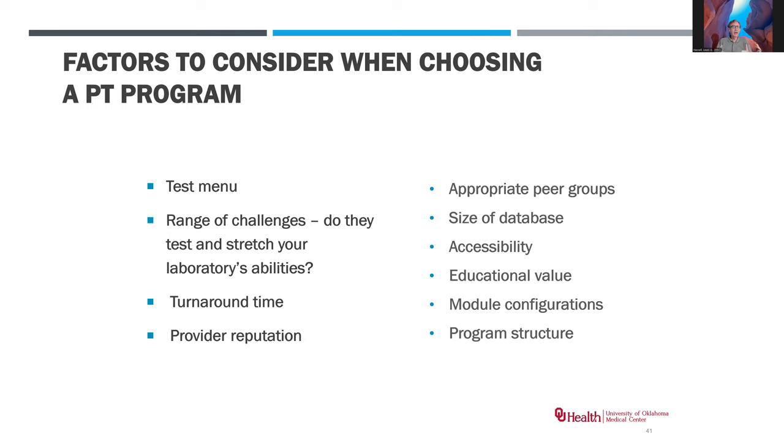Look at the various kinds of challenges. Are they the kind of thing that are going to stretch you and help you to become better? Do you get your results back in a reasonable time? Does this provider have a good reputation and so forth? Is the peer group that they're assessing with comparable to your laboratory? And is it a big enough database that you're going to get meaningful results? A number of other sorts of things like that go into the considerations.